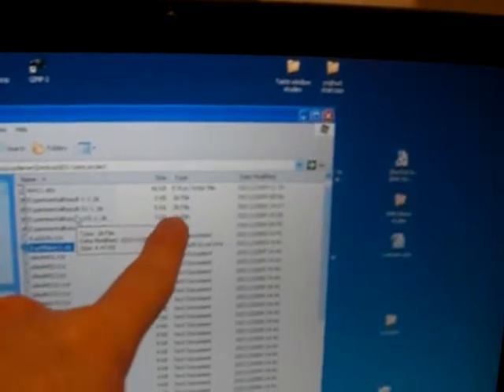Now most important to you guys, I'd imagine, is the results file. You'll notice at the top here, it's quite hard to see actually through this camera, which is a bit unfortunate. Can we scroll any further? Not really, doesn't matter. Now you have these .ja files. Each of these files contains the results for one participant. The other day, you ran the 101, the very first participant, and this person's data was stored in 101.ja. So we'll double click on that, and it'll automatically load within Excel.